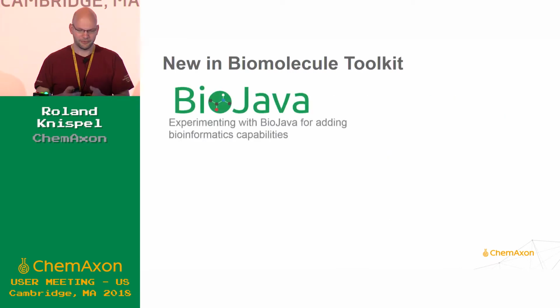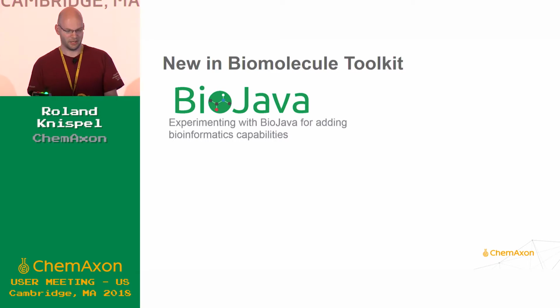Also here, there's a couple of new things I'd like to highlight. One of the most interesting things from our perspective, at least, is that we've positioned this thing at the interface between biology and chemistry. Turns out that a lot of users are still captured in the classical molecular biology workflows, where a lot of it is plain sequence, I would say maybe 95%. We're looking for options if we want to capture entities of all flavors in a registration system. Then the ability to also host bioinformatics capabilities is a very important one.